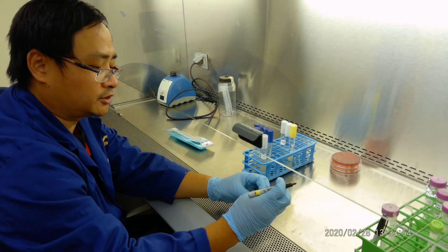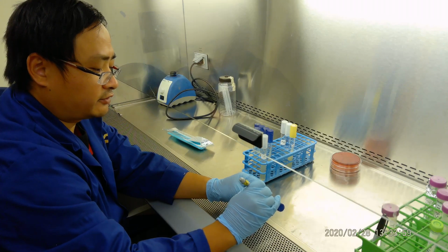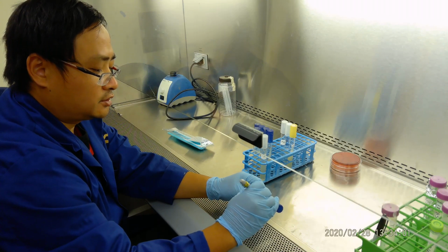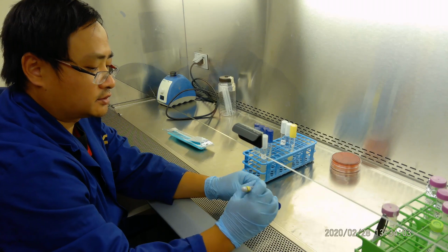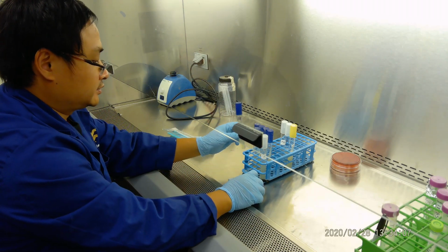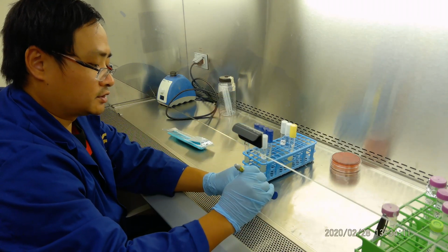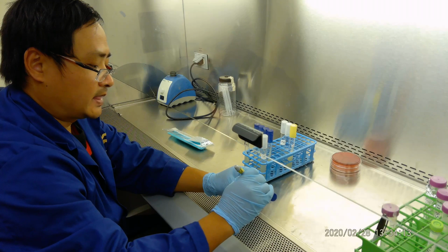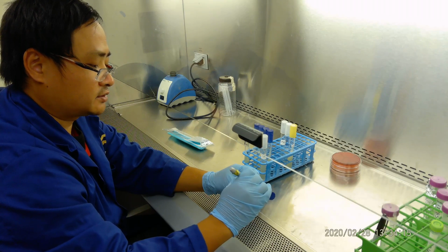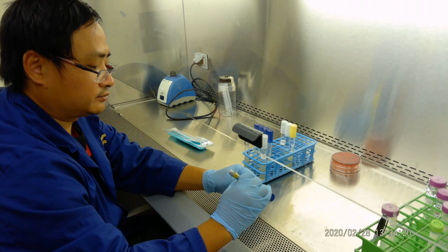So the first job of what we do is Serratia. We label at the bottom, like SM, 25 degrees Celsius, the initial and your bench number. So we take a picture right there. Okay. Now we do this first one, and we label the second one with Serratia, 37 degrees Celsius, initial, bench number, and date.